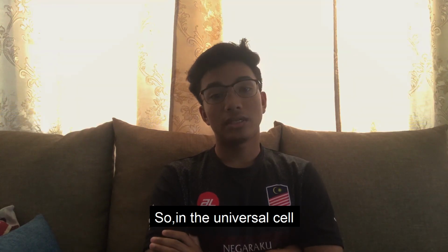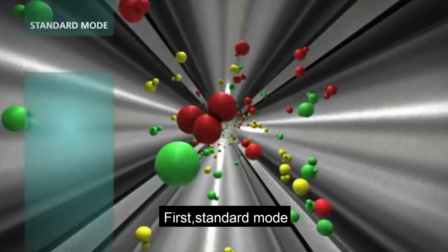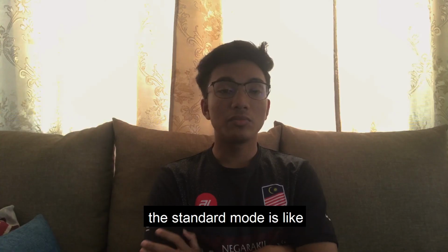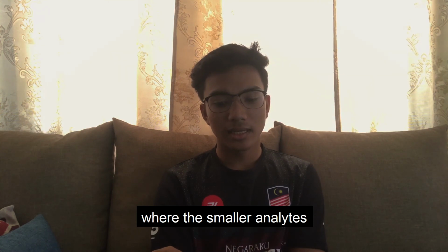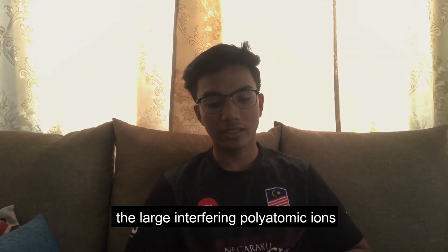In the universal cell, there are three different modes: first standard mode, second collision mode, and third reaction mode. The standard mode is like a non-cell instrument, while the collision mode uses a non-reactive gas, where the smaller analyte ions are separated from the large interfering polyatomic ions.